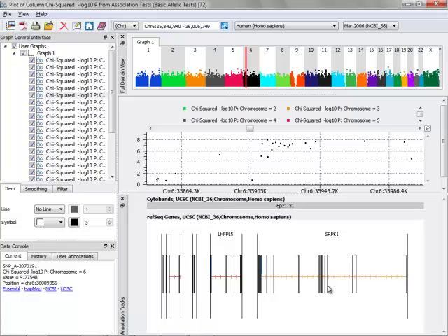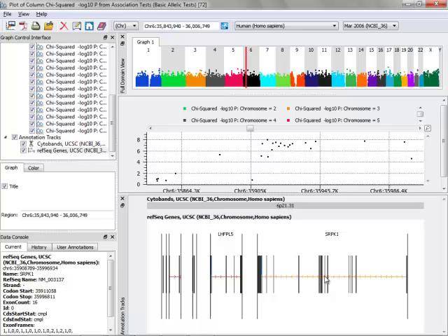I can get more information about this particular gene by just clicking anywhere on it, which then the information shows up in the data console down here. So here I've got the name of the gene, the RefSeq name, what strand it was on, codon start and stops, as well as the number of exons.